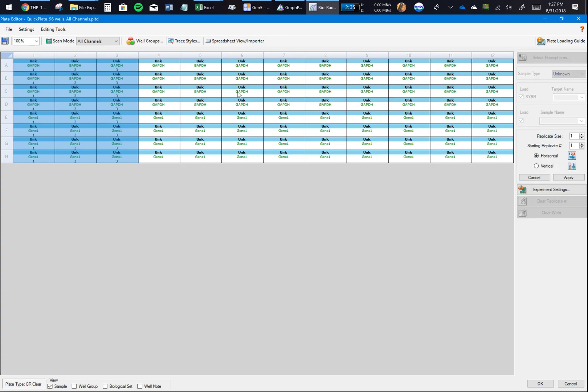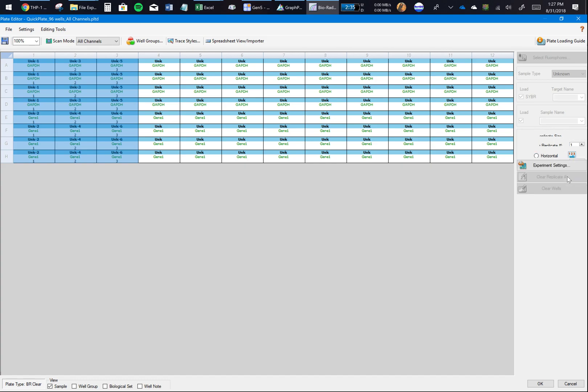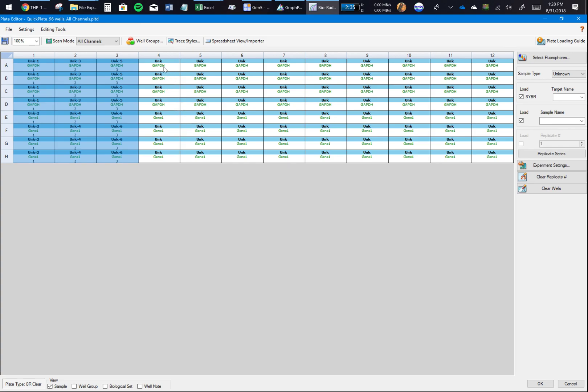Remember, this is the gene, this is the source of your RNA template. Let's say this was sample number 1, this was sample number 2, and so on. You can write these numbers based on whatever helps you identify them best. Now let's say I ran these samples in replicates, so I need to tell the software that these are replicates.